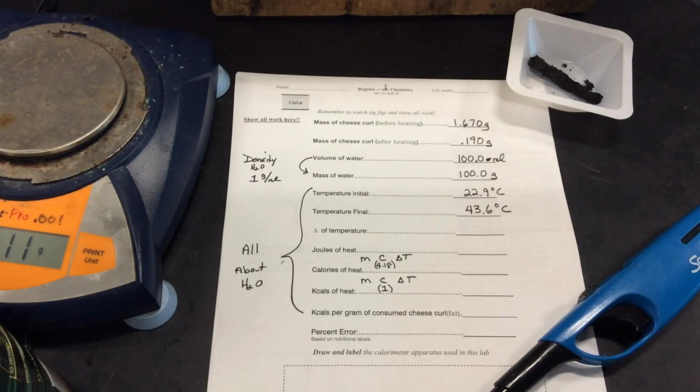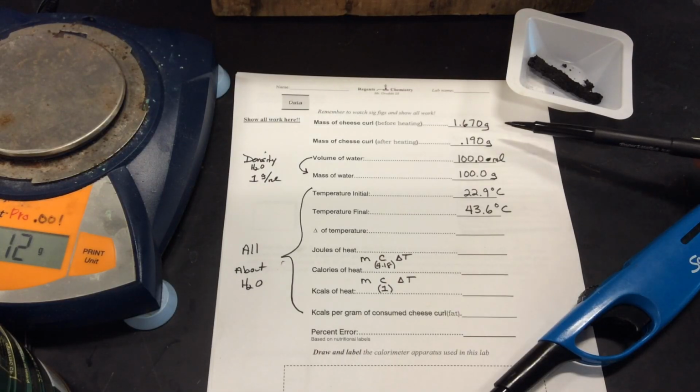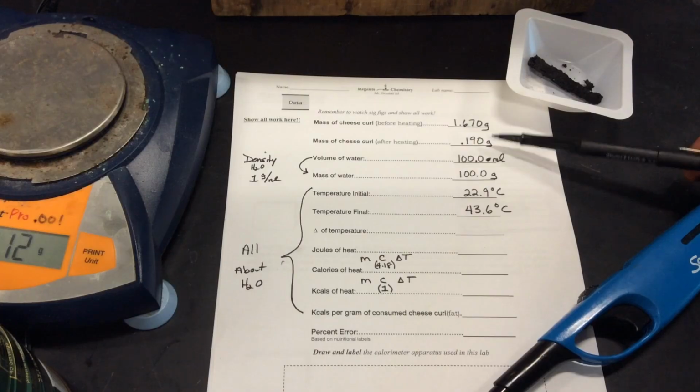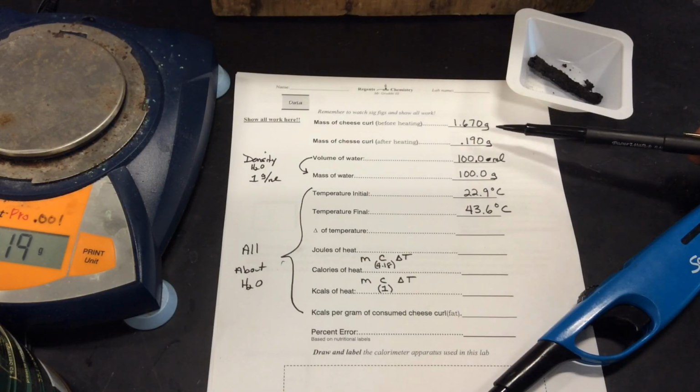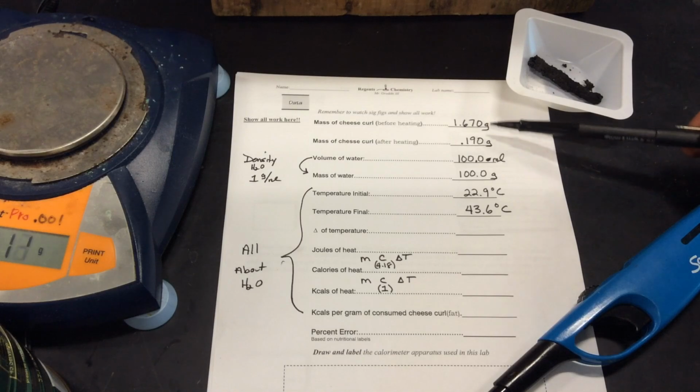And calorimetry, because we know how much energy it takes to raise 1 gram of water 1 degree Celsius, which is 1, we know how to get the calories. So we know the mass of the cheese curl we started with, and after we burn, the difference of this would be the what? The mass of the cheese curl that actually burned, or the fat. We're going to need that at the end.